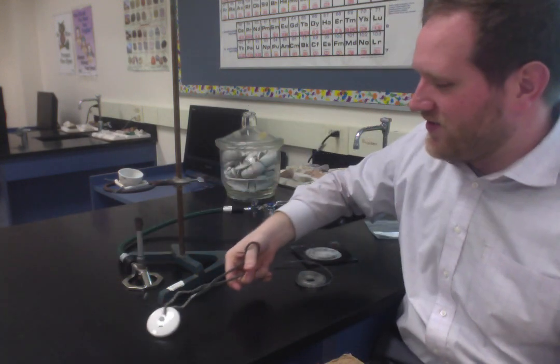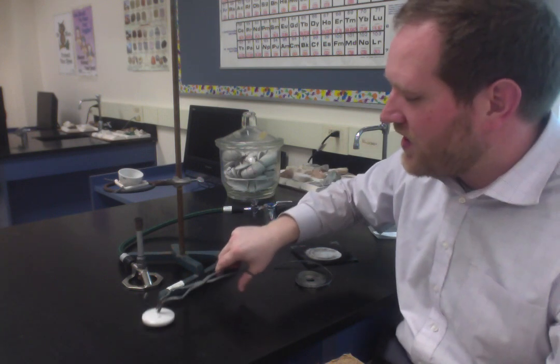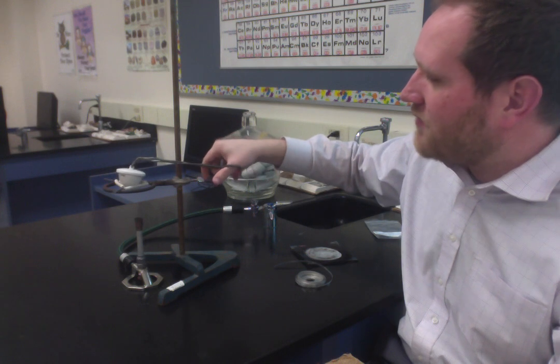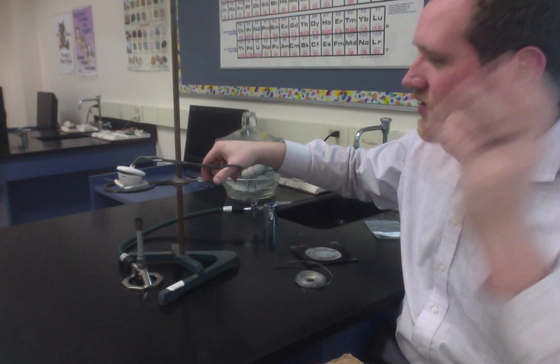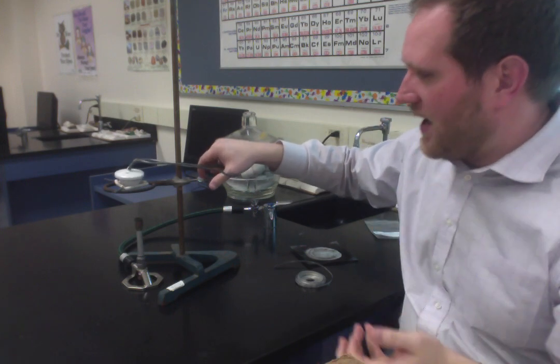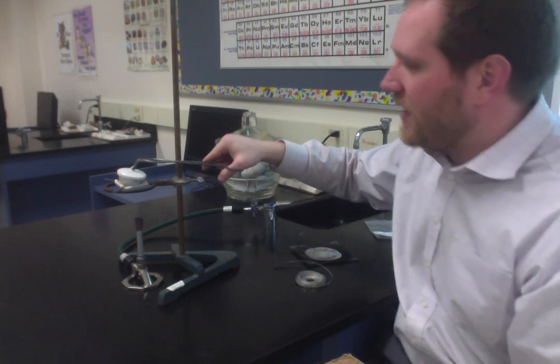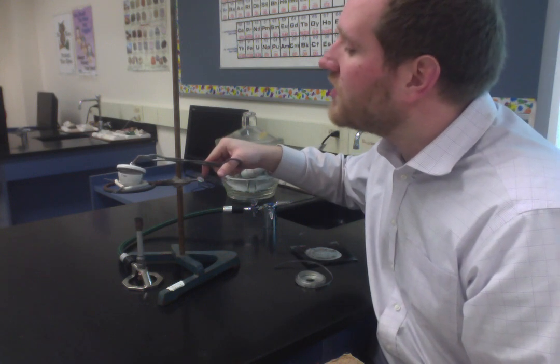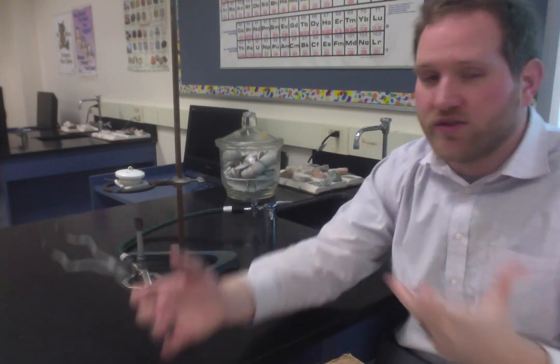Didn't break, but as you can see, these things can break if they drop from a sufficient height, so we'll be careful with that. So again, what you're doing is you peek inside, and as soon as you see that white flame start to open up, you cover it back up. Okay? You let it burn for another 30 seconds or so, or a minute, follow your teacher's instructions, and then you're going to peek again. So you peek, and you close it. And you're going to repeat this for 5-10 minutes, depending on what your teacher tells you.